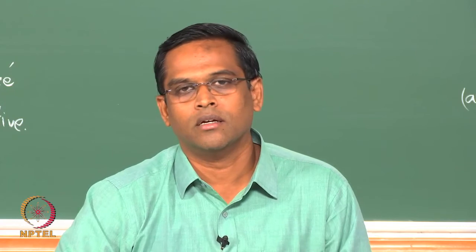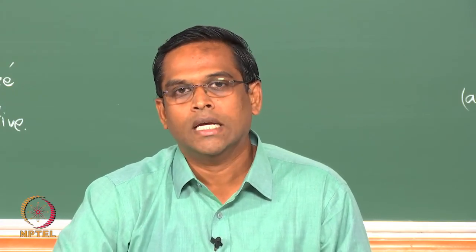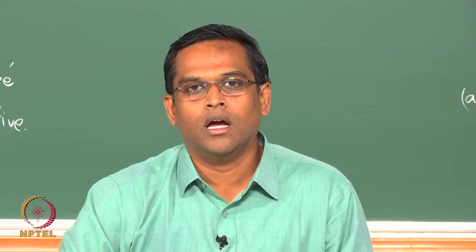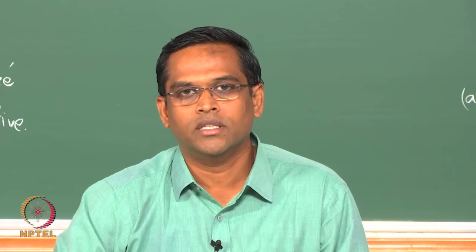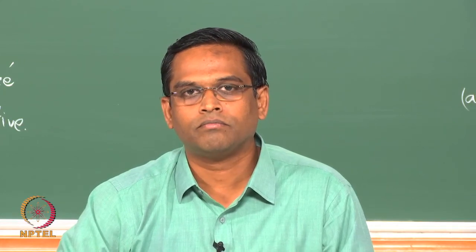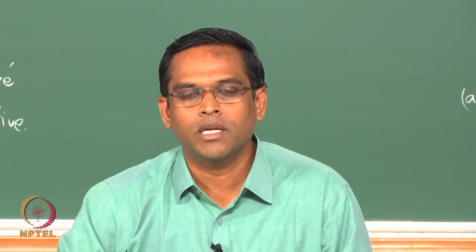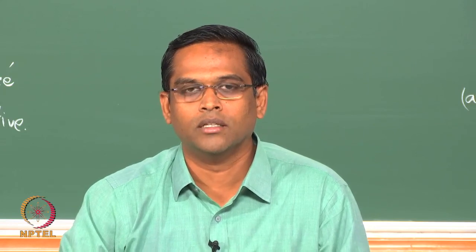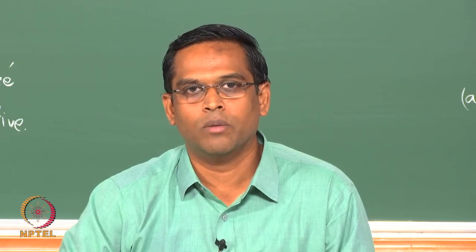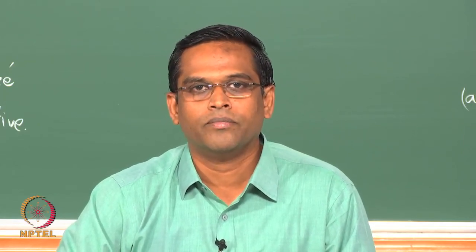So with that, I would like to move on to the next technique. What we have now seen is bright field illumination in a conventional metallurgical microscope, the kind of information you get, what I have just demonstrated. In the next class, I will start with another variant of optical microscope, and then I will similarly show the actual demonstration of the different contrast which you obtain from the microscope. Thank you.